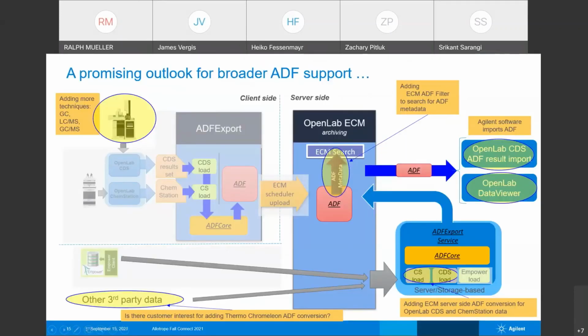Thank you, Heiko. So when we look into the future, we now have a comprehensive system around the archiving capabilities, but we are thinking of bringing more to this table. And here are some additions we could imagine for the ADF 1.4 in the future then.